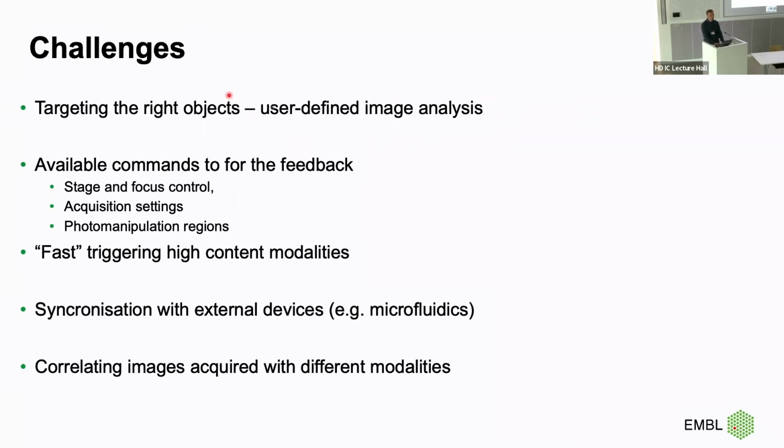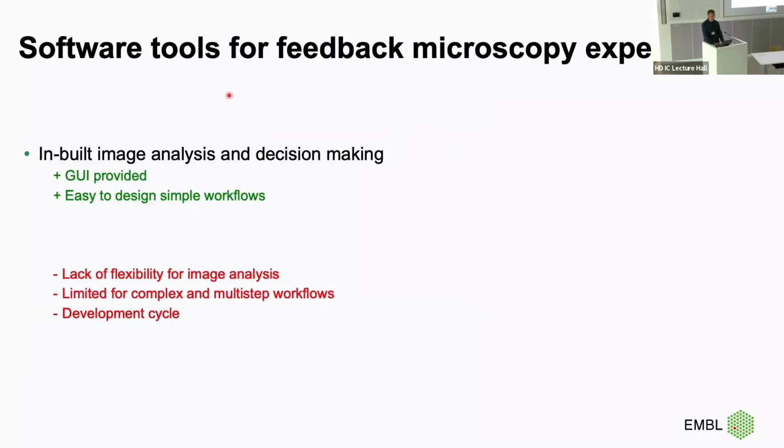All right, so now coming closer to what kind of solutions we can provide for that, right? First of all, and I would really appreciate having all the industry community here, the amount of inbuilt solutions is growing, and this provides easy access to novice users, right? And this is also attracting more and more attention to this type of field, because we have a number of solutions provided by different companies where we have a graphical user interface, and it's easy to design simple workflows.